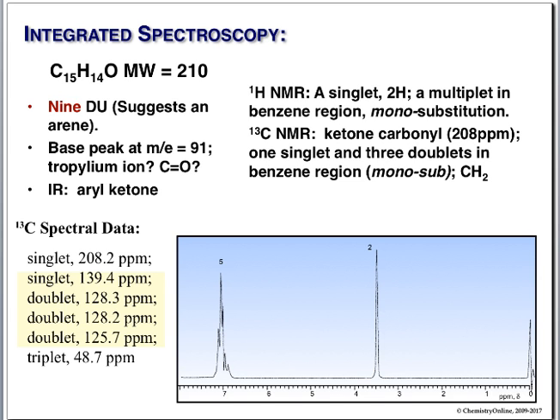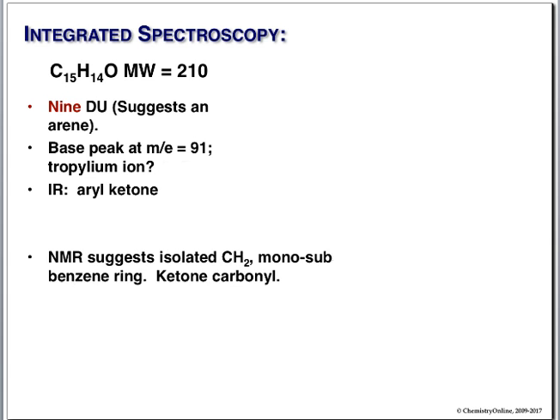All right, put these together. Again, you get full credit. This is all you have to give me. The structure is optional, but it'll drive you crazy if you don't get it. Start with your ketone carbonyl.